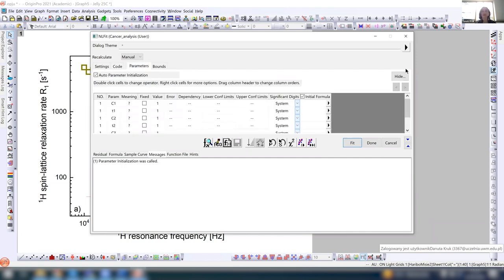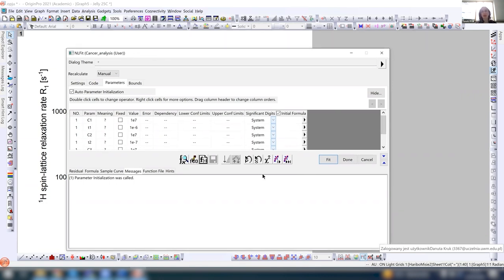So let us see what happens. Parameters. Well, I really do not know. Let me put something like a typical value, power 7. Then let's say that the longest time is -6. As I have completely no idea what will happen, I just use something for the dipolar relaxation constant. So the intermediate process, let it be something somewhat slower, so let's say -7. But as I said, I know nothing. I'm just trying. And the fastest one, -8. And I don't know whether I need the factor A or not. I have completely no idea what happens.